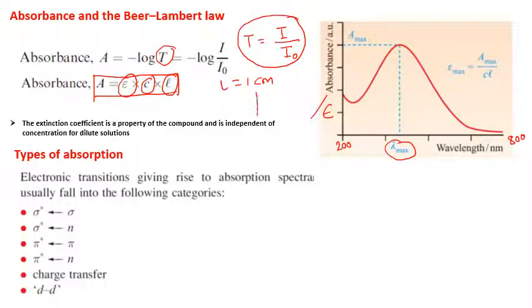So basically in UV, what do we actually do there? In the UV cuvette you put your sample dissolved in the solvent, and the machine detects the absorption value or transmittance value depending on the nature of the machine.